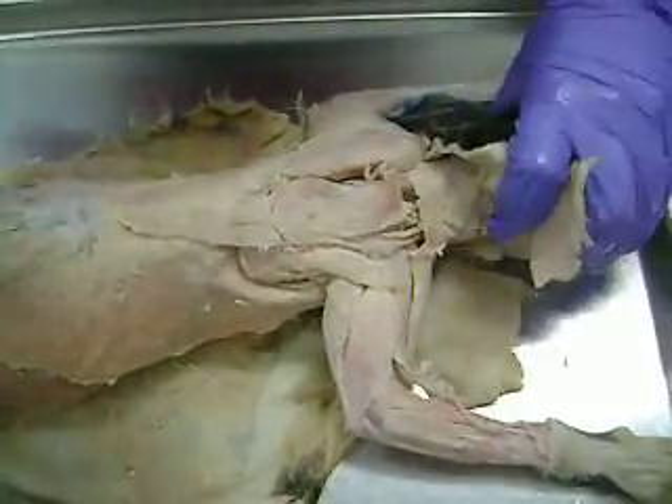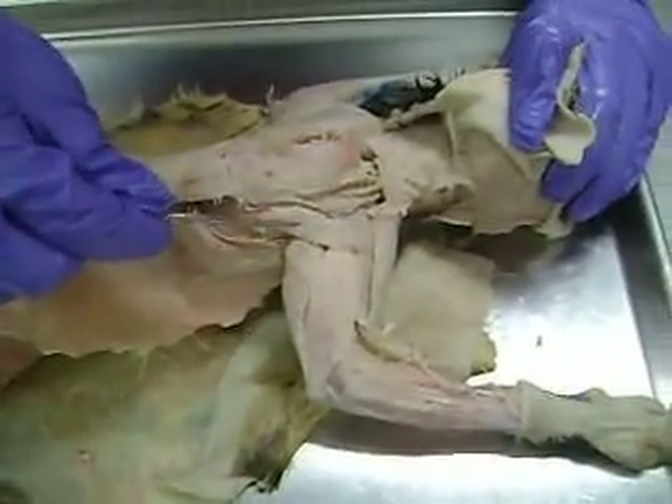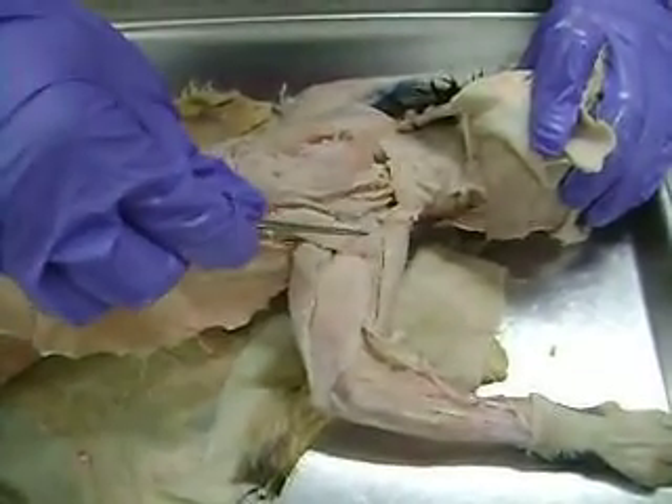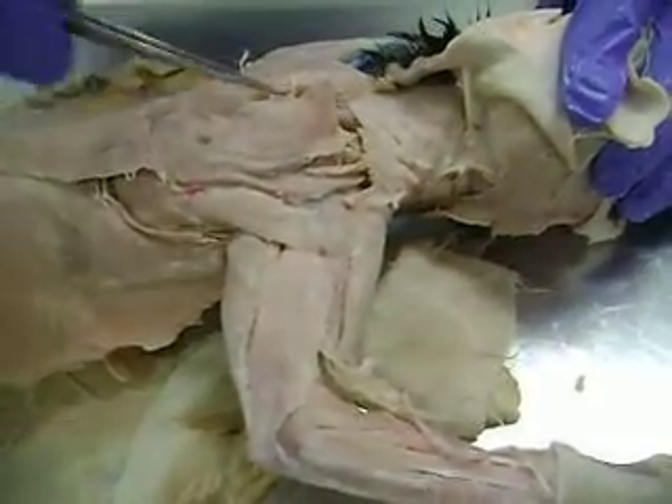And likewise, you have the same thing with the deltoid muscles. So you have spinodeltoid, acromiodeltoid, and clavodeltoid. Both of those muscle groups are in the same order.